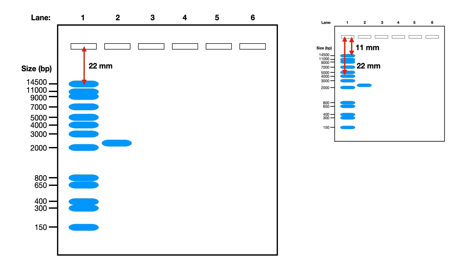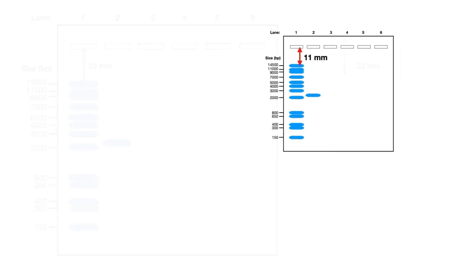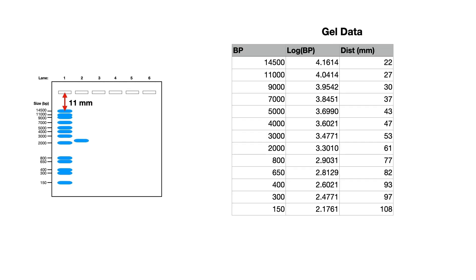In fact the distance is now 11 millimeters. So what do we do in this particular case and does it make a difference to our final answer? Well if we take that gel and we do as we did with the slightly larger version, we've got our base pairs, we've got our logs, and we've got our distances.